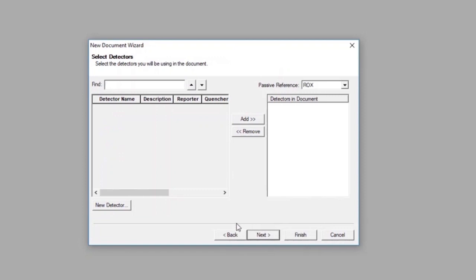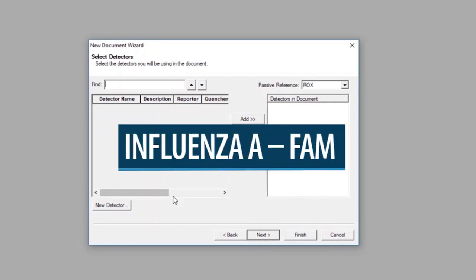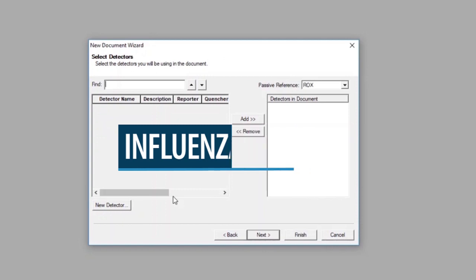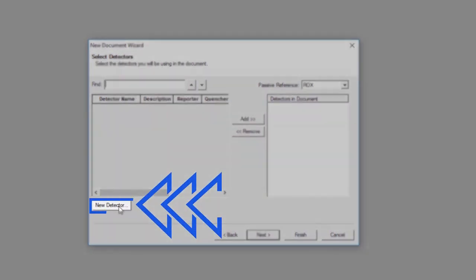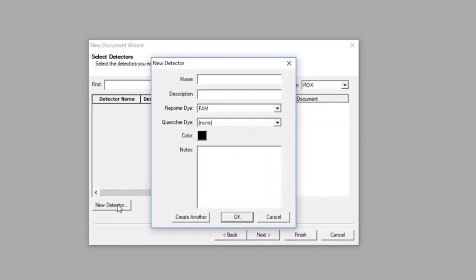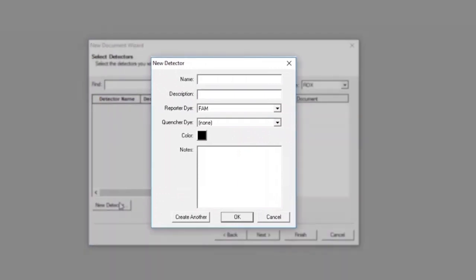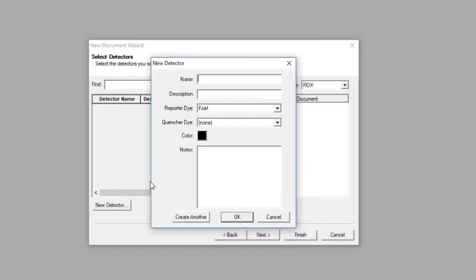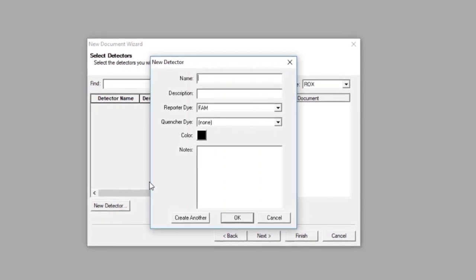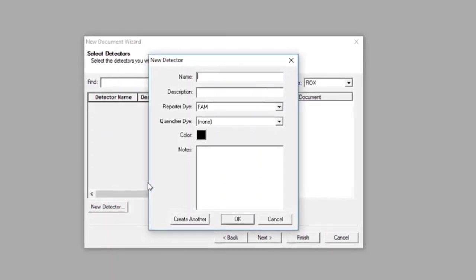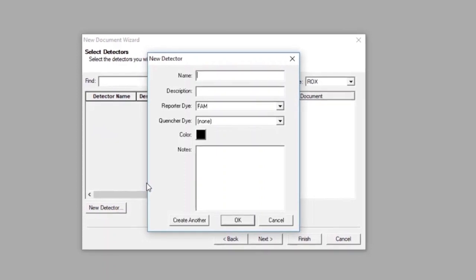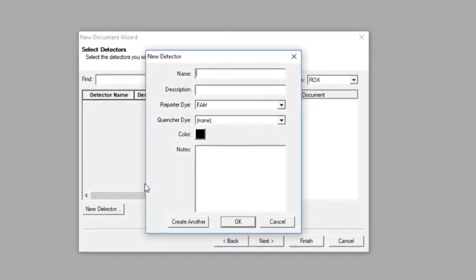The next screen that appears is the Select Detectors screen. To make a new detector — for example, an Influenza A FAM detector — click the New Detector button. This will bring up the New Detector window. A new detector will need to be defined for each target in the Flu SC2 Multiplex assay, if this has not been previously done.